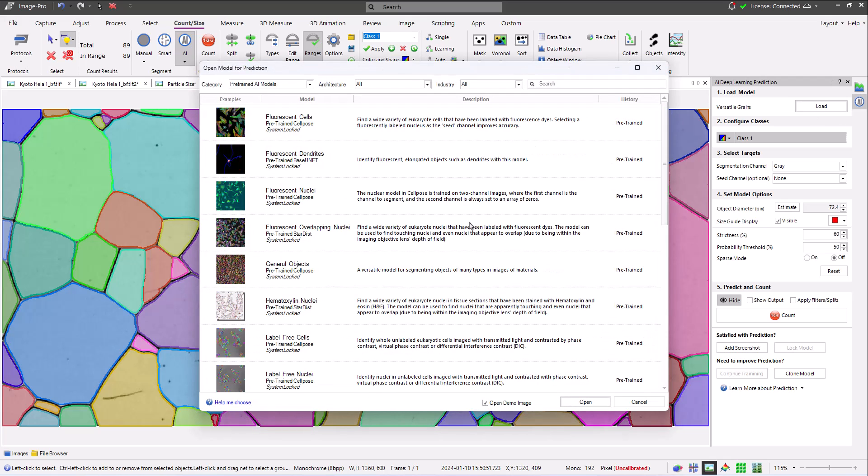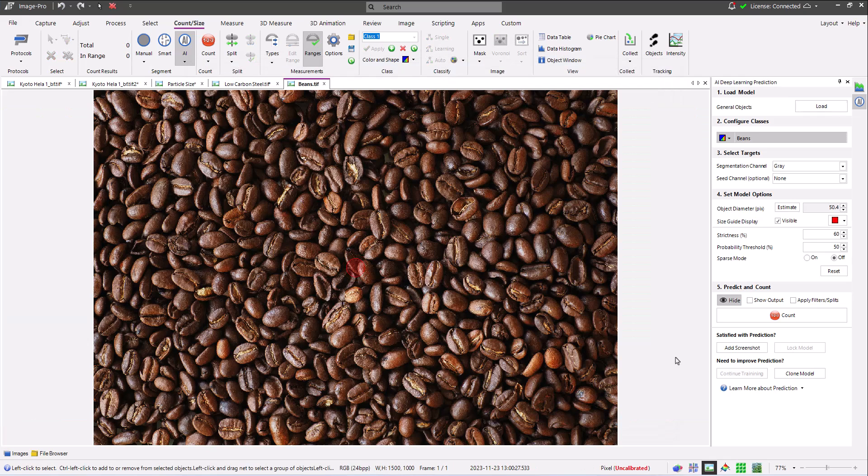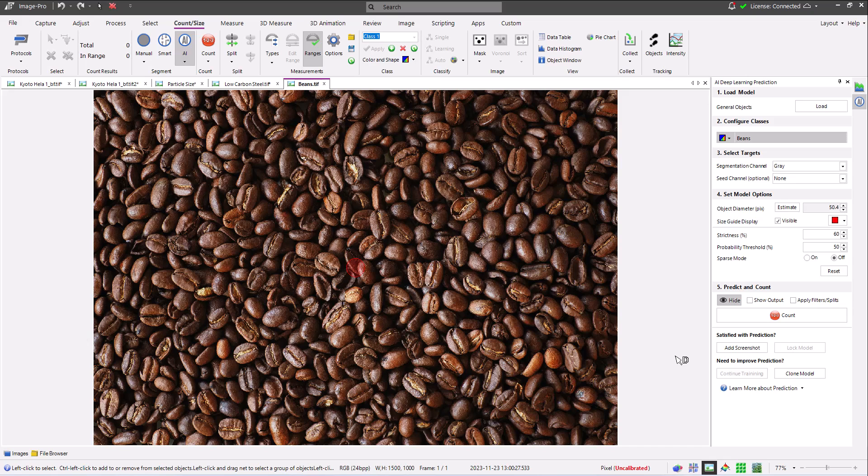I'm finally loading the versatile general objects model. We've deliberately chosen an unusual demo image for this model, a field of coffee beans, in order to illustrate the versatility of the model.